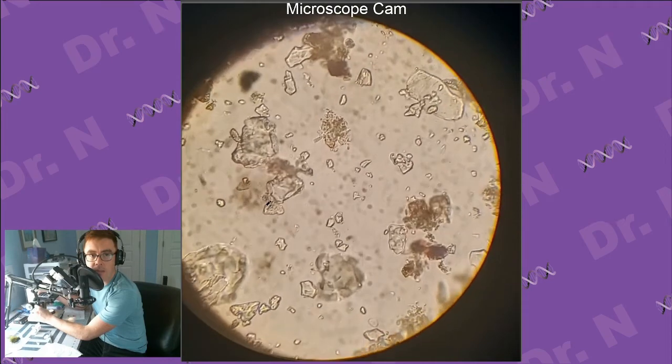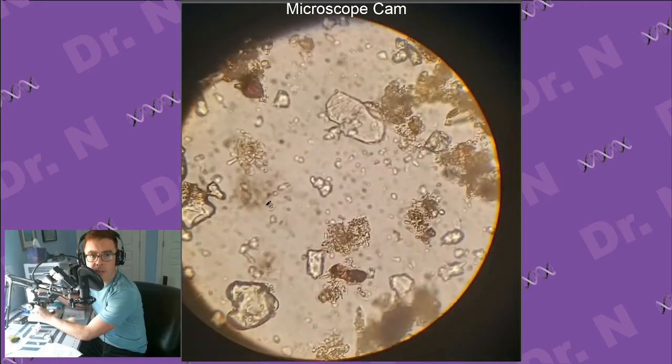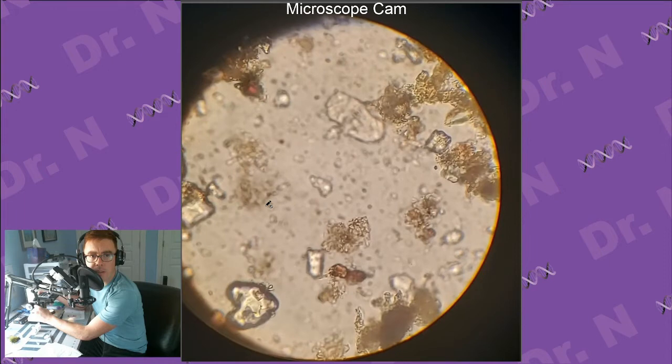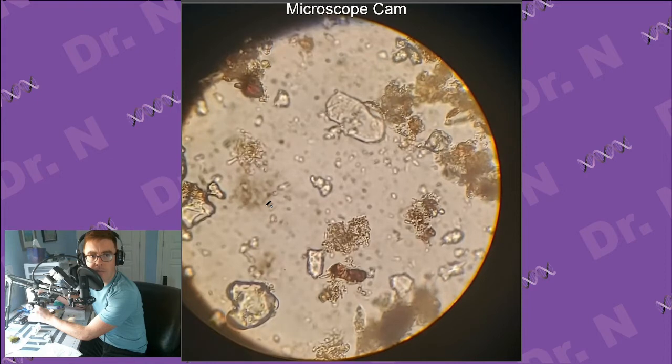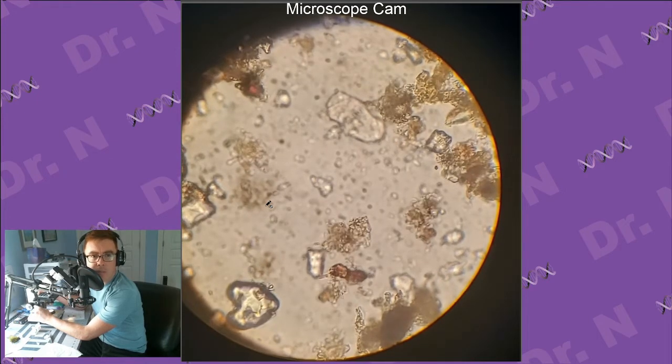Oh, wait, hold on. What are you? Can't quite get him in focus, but there is something moving around right there. Oh, just missed him. That size, it could... Oh, there he is. I think that is a very small... I'm going to say eukaryote.